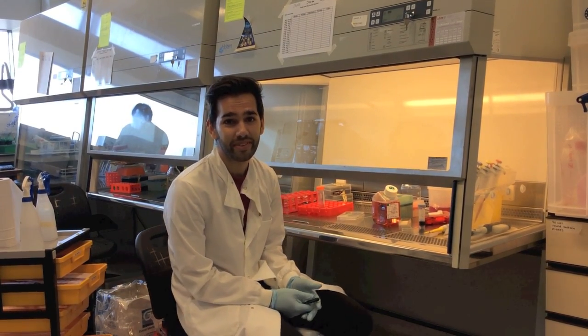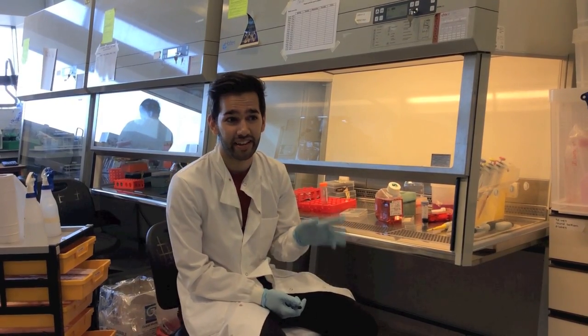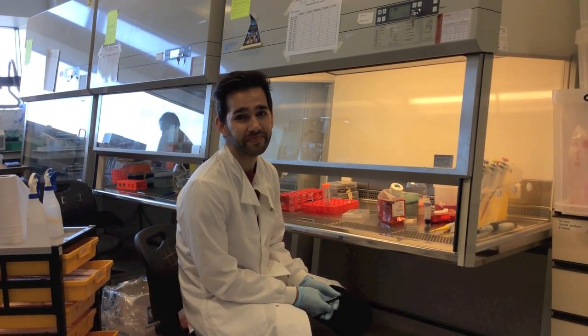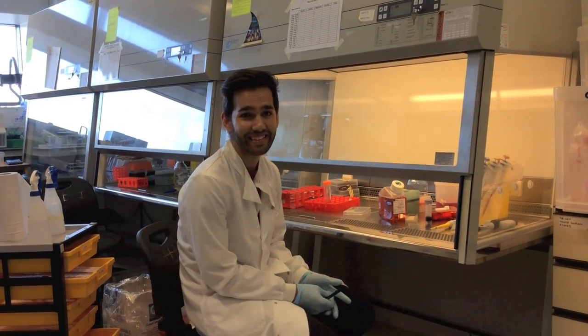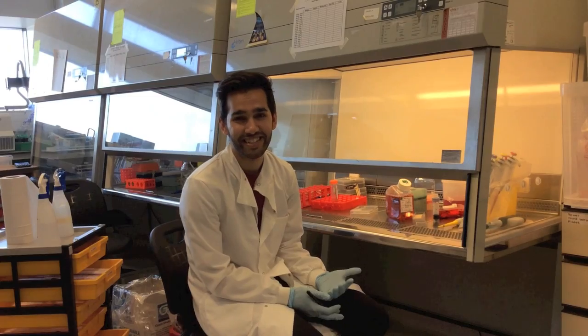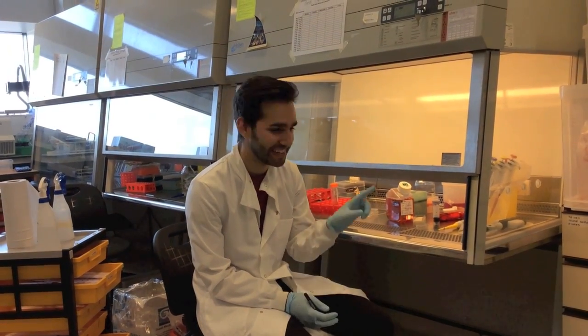What virus are you using? We're using hepatitis C virus. This is going to be done in the high safety laboratory where everything's kept under control. Brilliant. So how are you going to measure infection after you have transmitted virus? After we put the virus onto the liver cells, we're going to stain it with an antibody that makes it glow, and then we're going to take this into the dark room with the microscope, and I'm going to sit there for many hours counting and looking for little glowing liver cells.